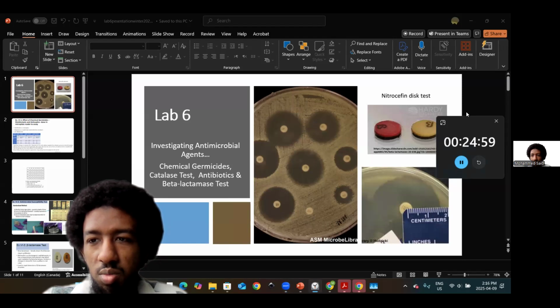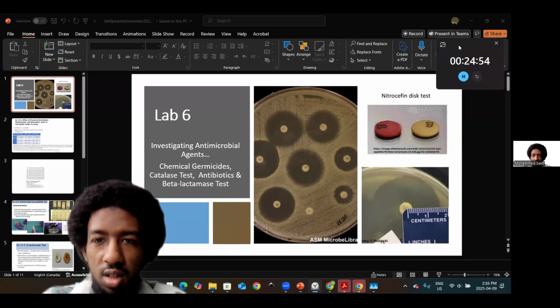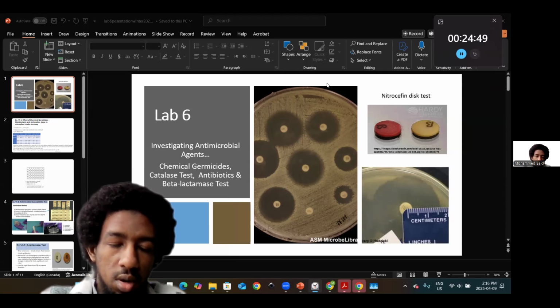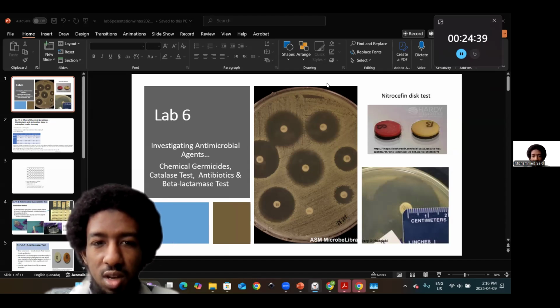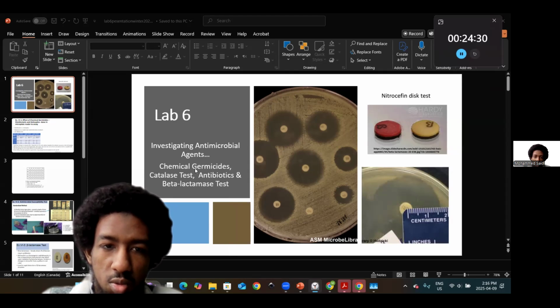So inshallah ta'ala, we'll begin, starting now with lab 6. We went through lab 5, generation time, and now we're into lab 6, as mentioned before, about environmental conditions. Even though this may not appear to necessarily be the case, we are dealing with different types of germicides.